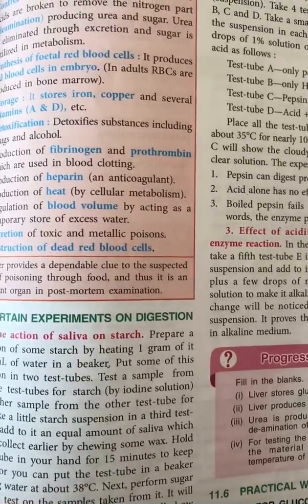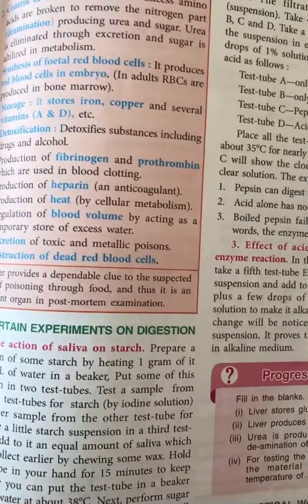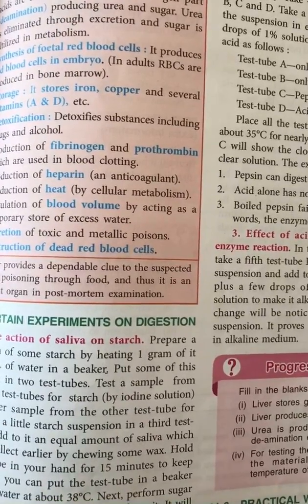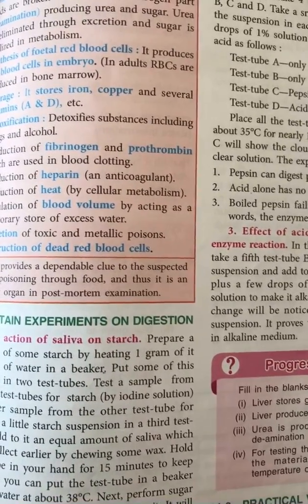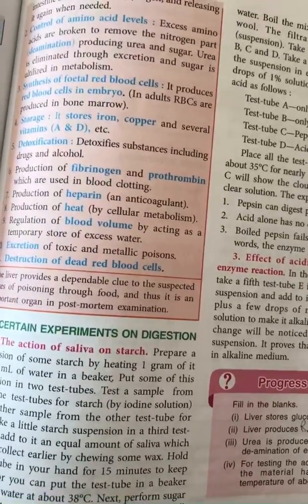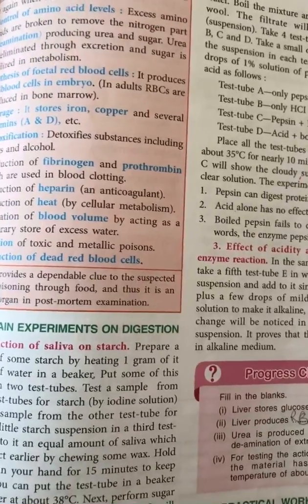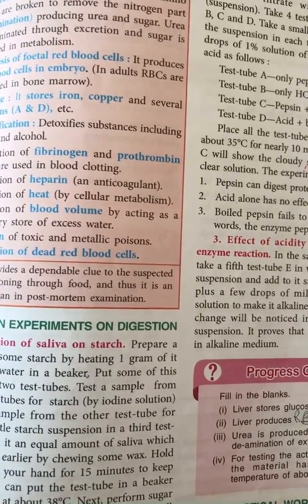Today we are going to start with the experiments on digestion. Last time we had read about the liver and its functions. So now we are going to start with the experiments on digestion. And here we are first going to study the action of saliva on starch.